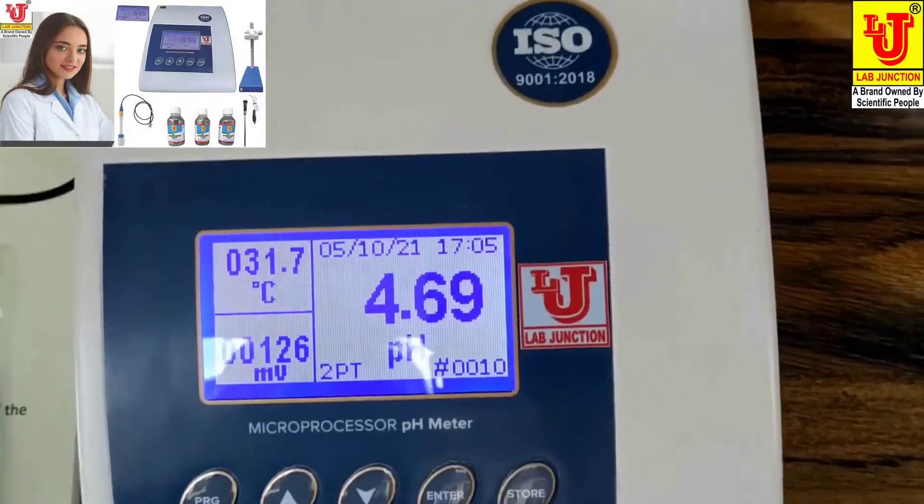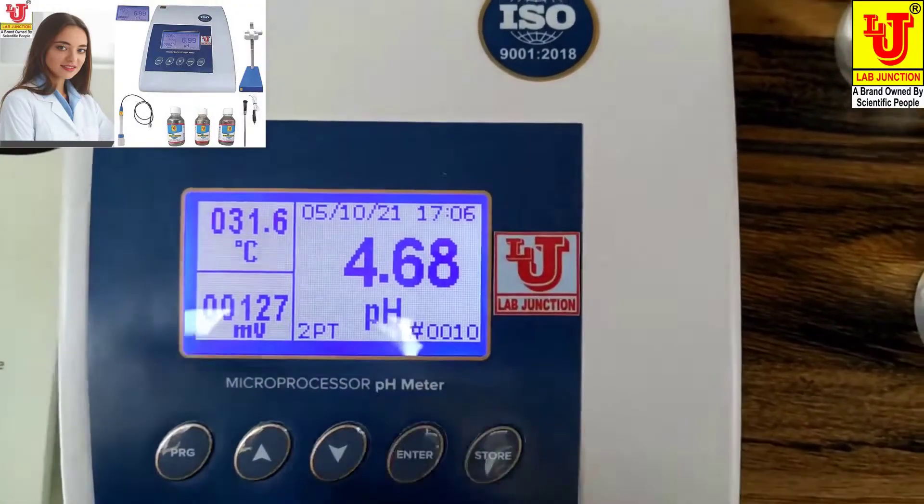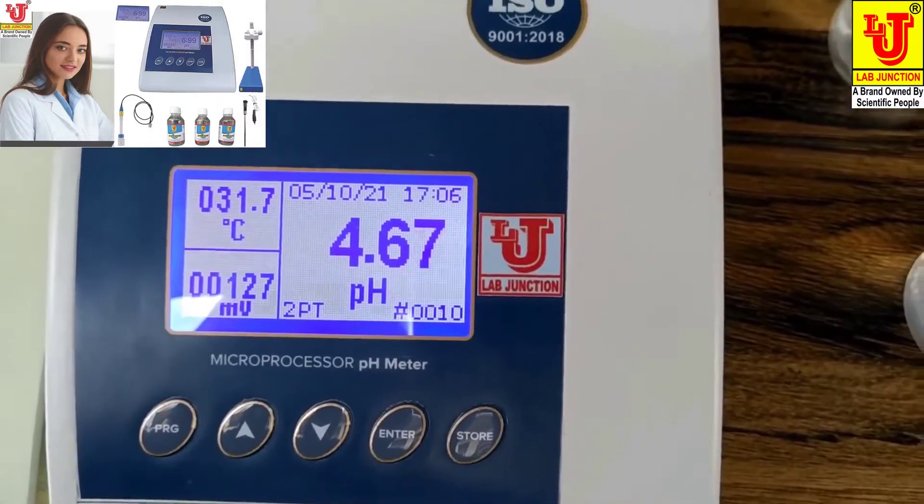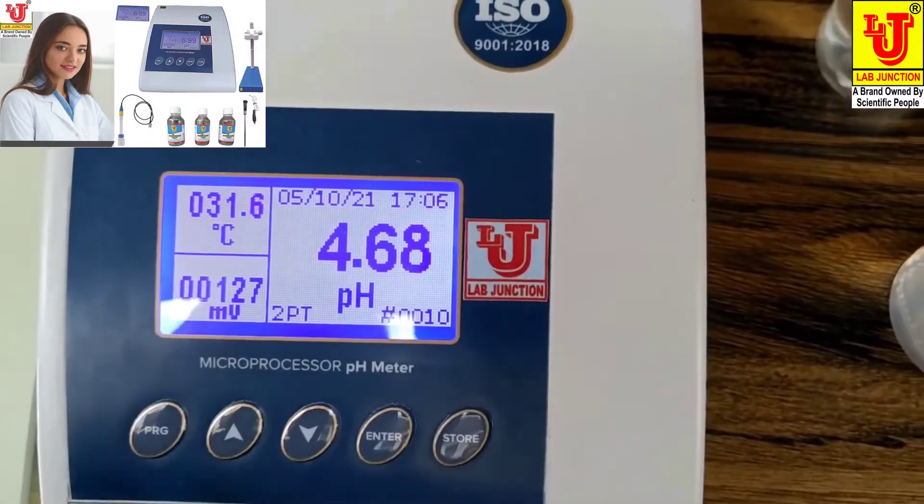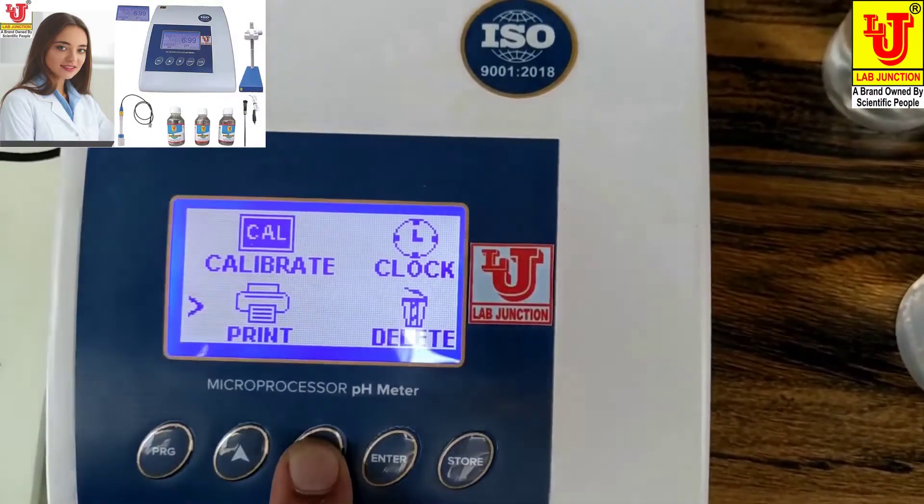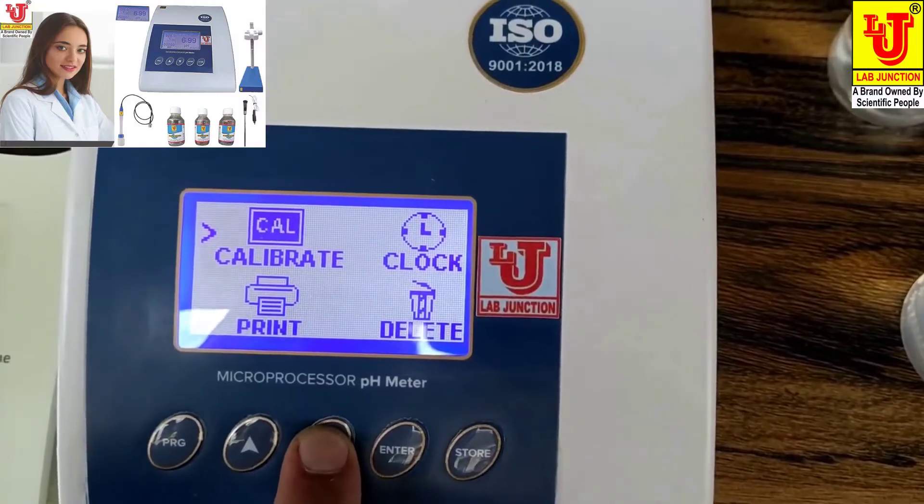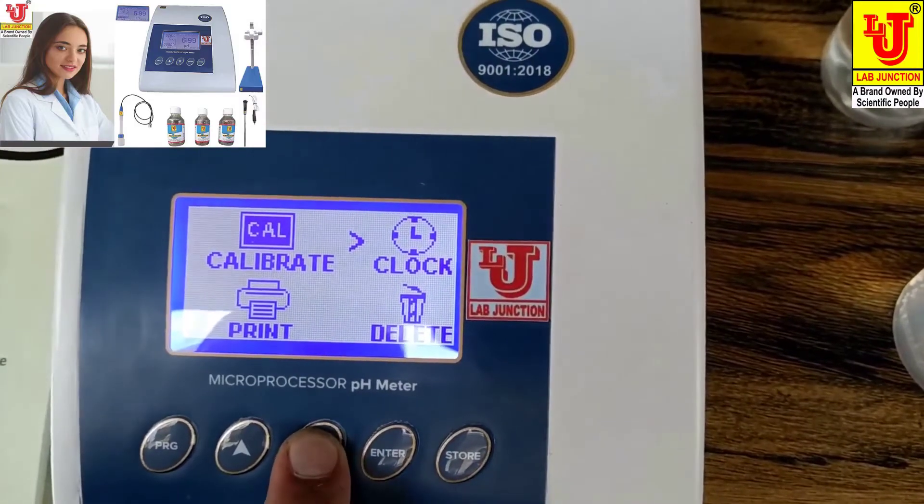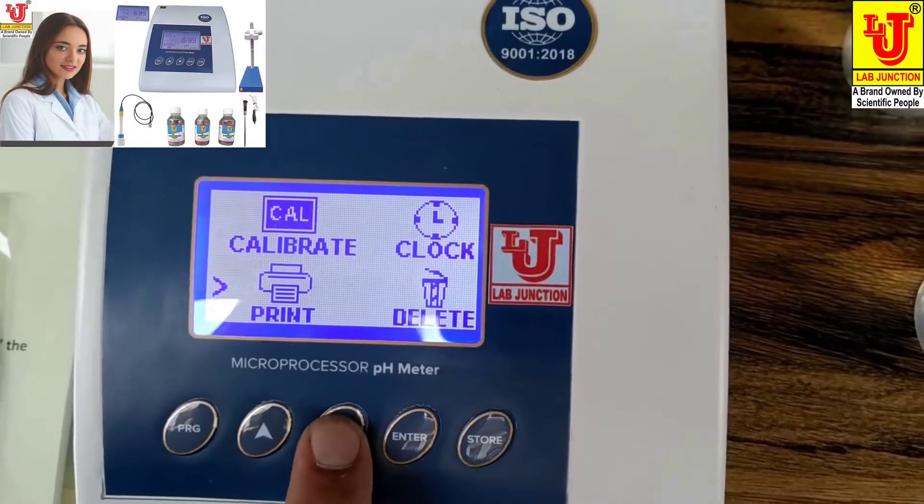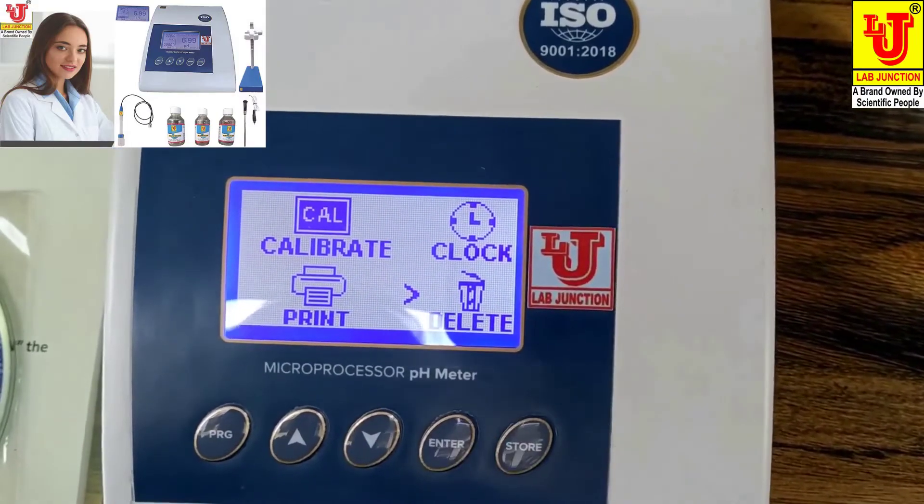Now first, this is the main display. How we can calibrate the pH meter. You can press the program key. This is calibrate, clock, print setting, and this is delete data.